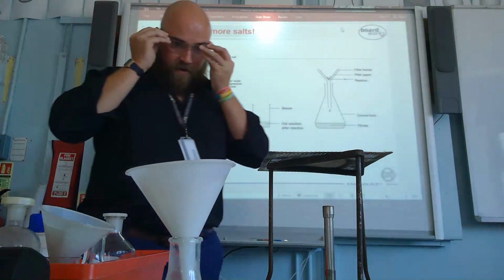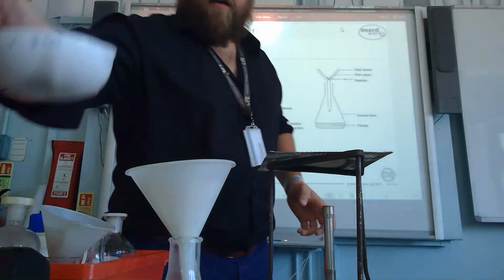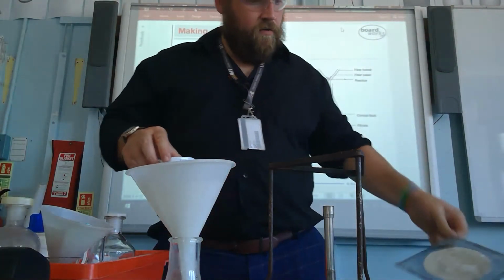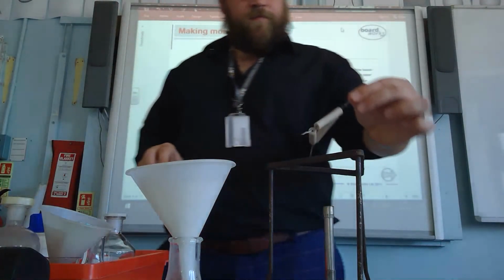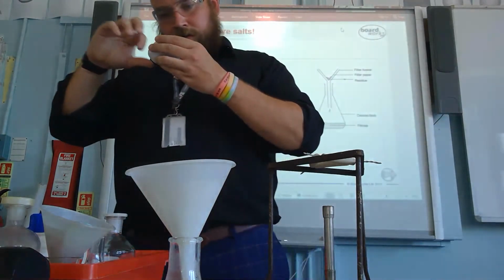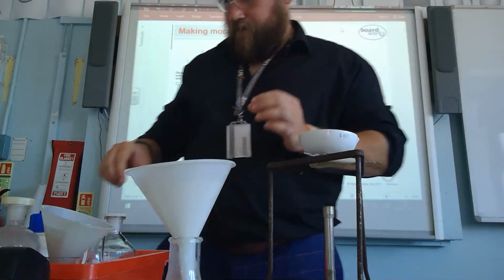So whilst that's going on, I need to set up the final part. So again, just like we did the other day with our blue crystals, I'm going to recrystallize this. So I'm going to replace my gauze with a clay triangle. And then, hopefully that's not a crack. Get rid of any dirt. Fine.